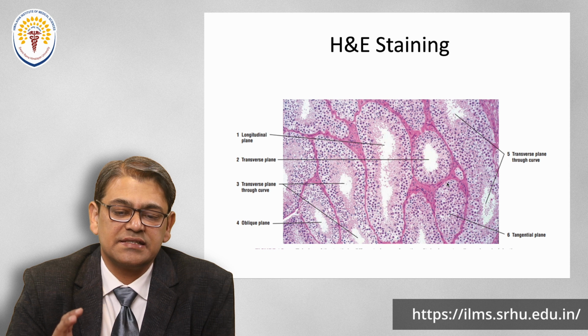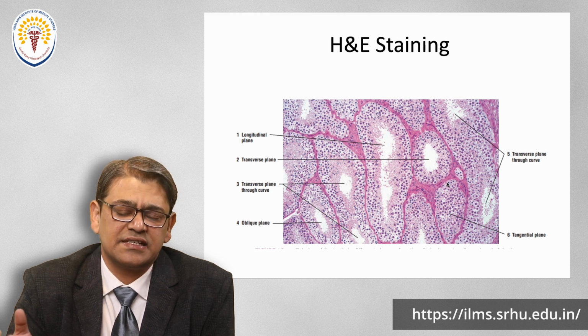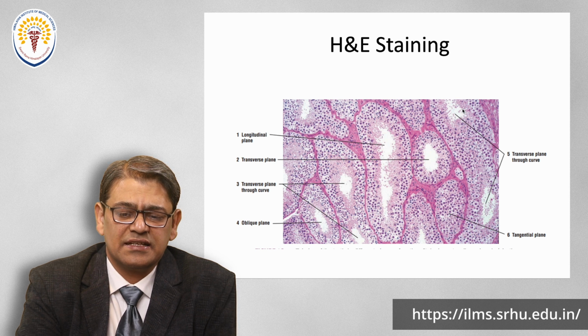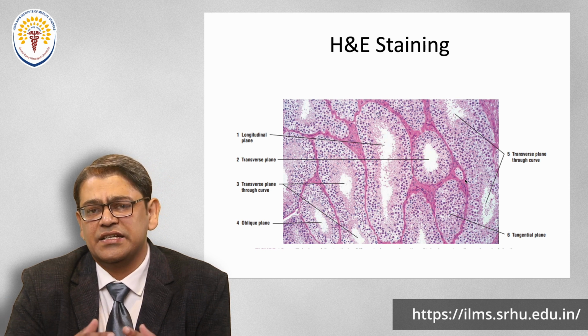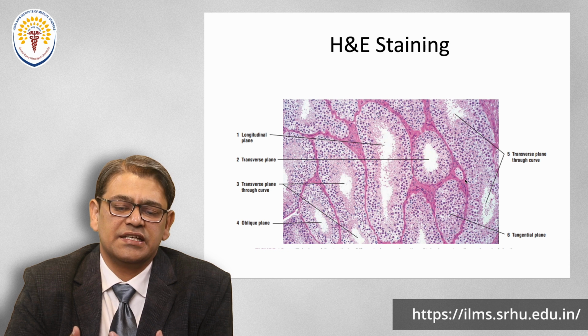The other structure is pink colored, and that pink colored structure is eosinophilic. It is an acidic structure, so it attaches to the basic structures, and we see they are in this sort of area. So the pink and the blue are the two colors, and they create various sorts of grading or coloration which we see in this slide.